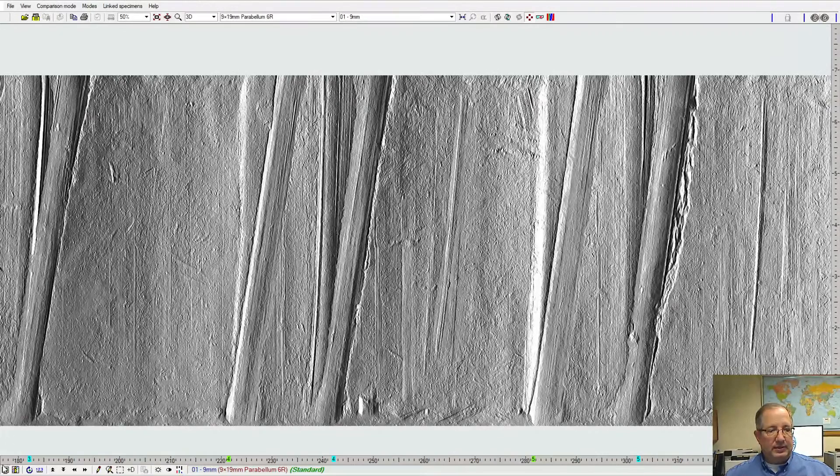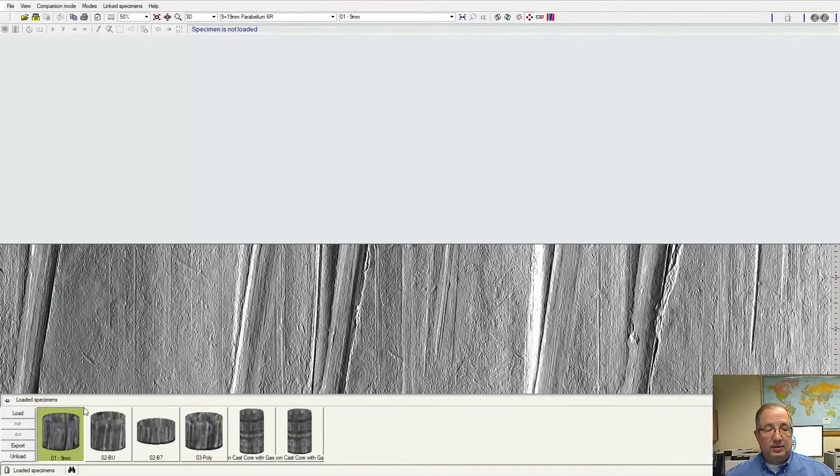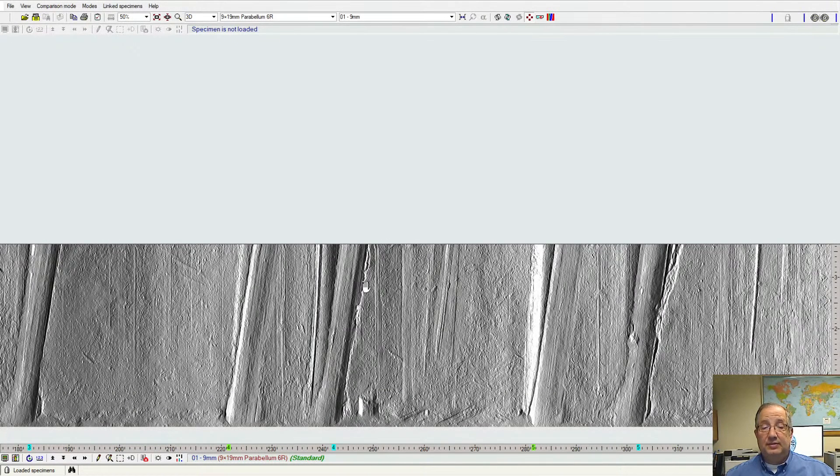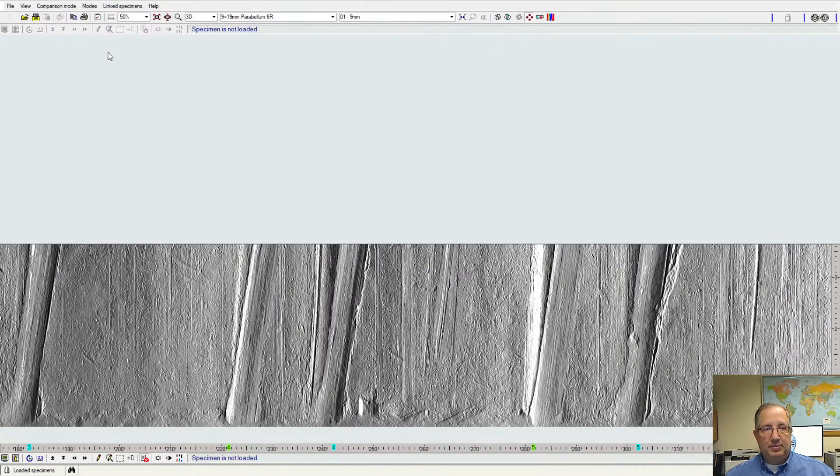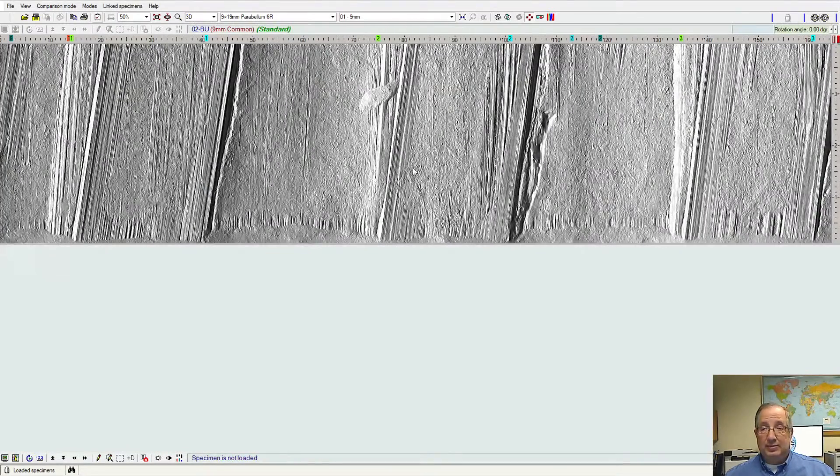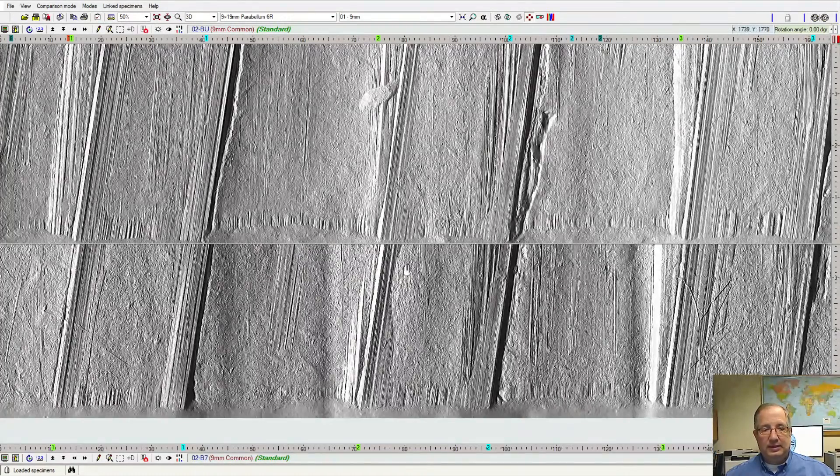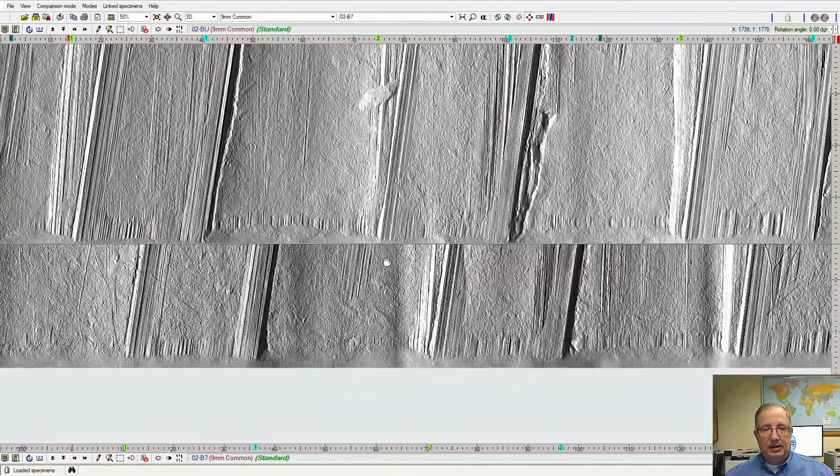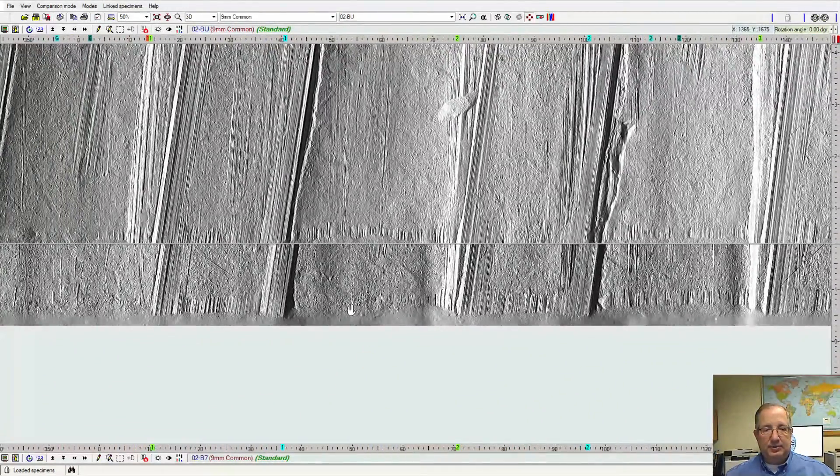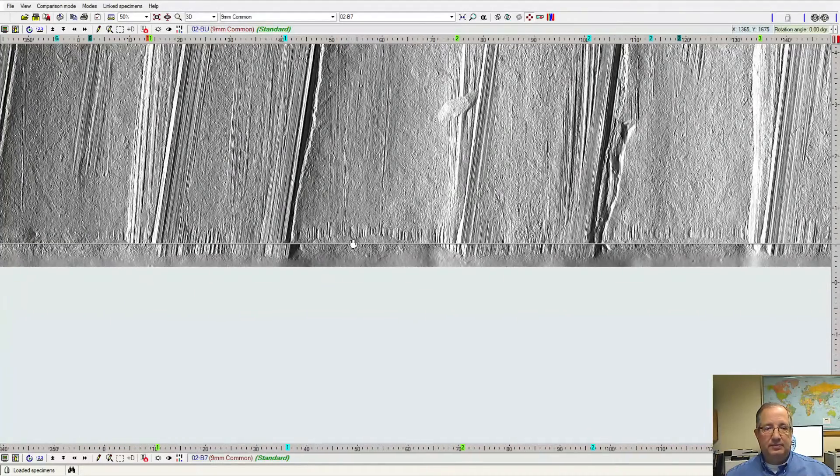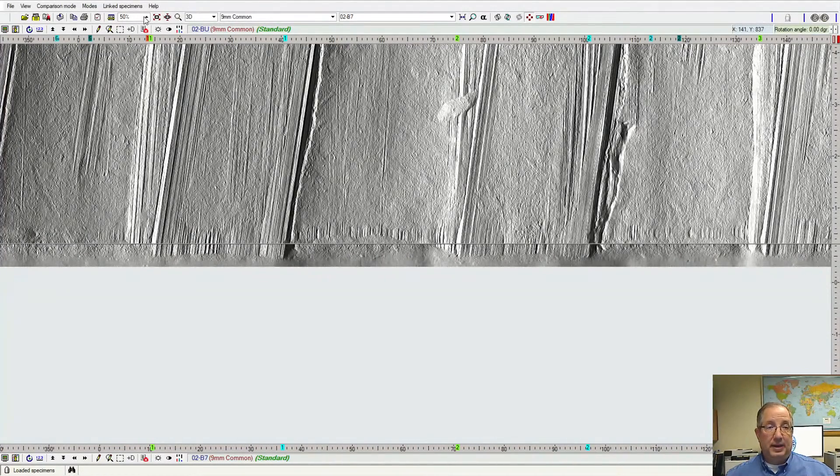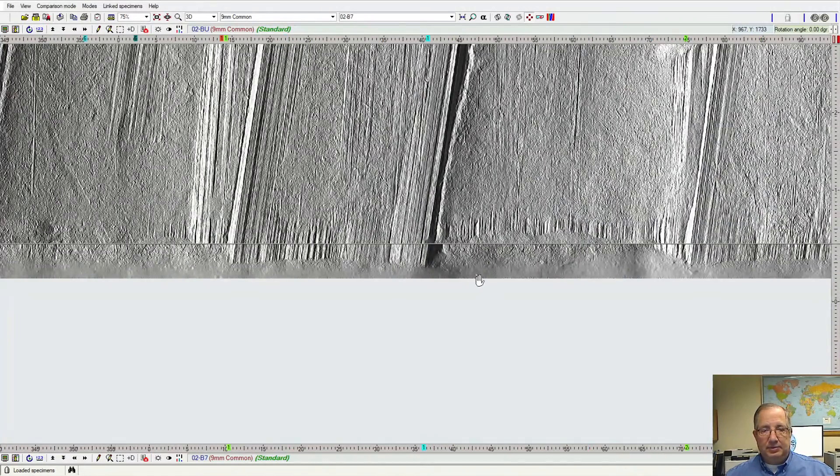Now, as we had done with the cartridges, we can also do comparisons between two samples. This time, instead of having a side-by-side split, we can do a vertical top-to-bottom type split where we can place one sample on the top, load a second sample on the bottom, and now we can take these two samples and line them up next to each other to see if we have comparison between or a match between any of the features on these samples.